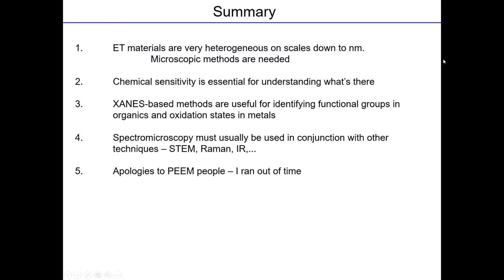Being somebody who's not an expert in STXM, I'm interested in the fact that clearly you're not dealing with much material ever. So what's the smallest size of feature or particle that you can actually analyze using the technique? Well, the spot size is more or less around the size of the outer zone of the zone plate, so typically around 30 nanometers.